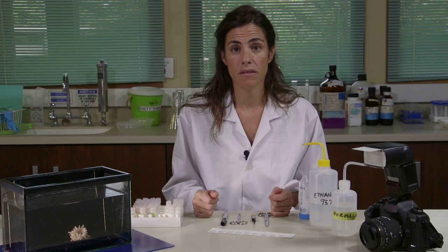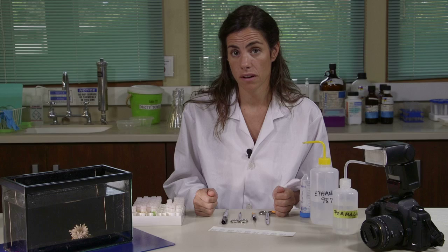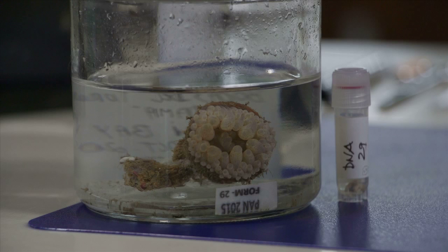Depending on the size of your specimen, especially if they are bigger animals or if they are very contracted, you should inject some higher concentration formalin on the specimen, either with a syringe or with a pipette. It is very important that all the images, the molecular samples, and your whole specimen in formalin are correlated and labeled accordingly.